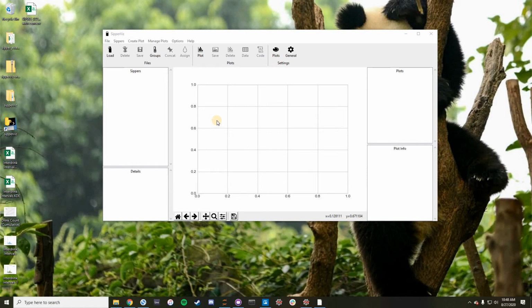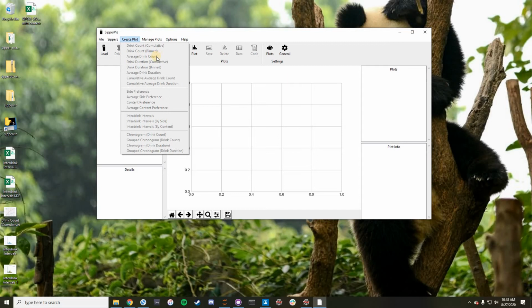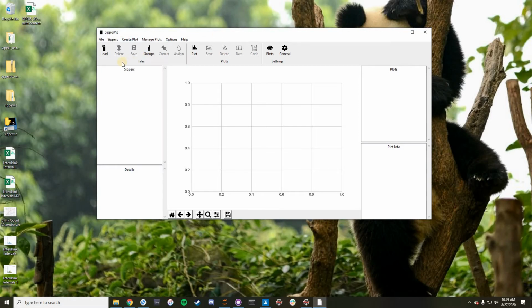Hi, so in this video I'm going to talk about averaging in SipperViz and making average plots. There are different plots for averaging the drink count, drink duration, and for the side and content preference as well. But we're just going to start by making this average drink count plot. That's about the most basic one.